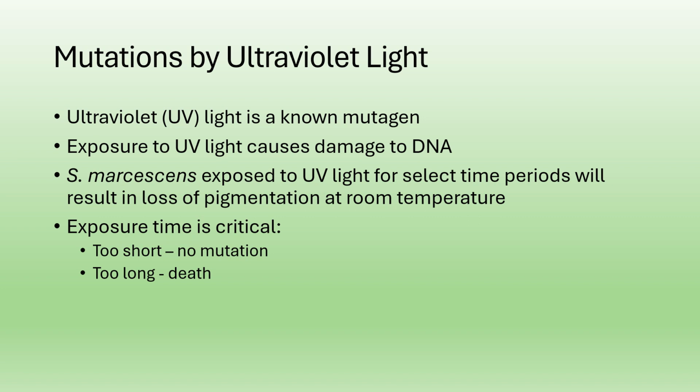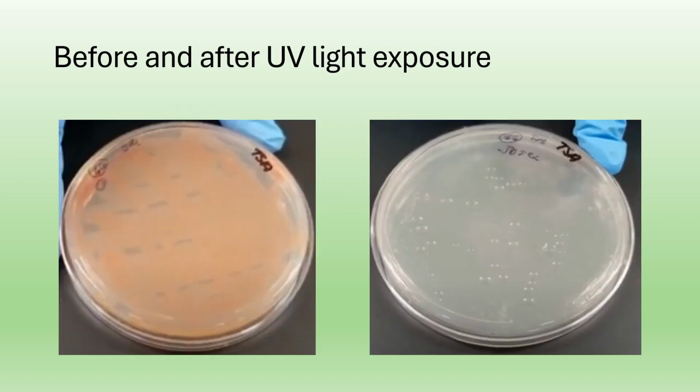But if the exposure time is too long, actually it can end up killing the cells. So the timing of the exposure time is very critical. So we're going to try to see what time will cause the mutation and have a change in that pigmentation, but not kill the bacteria.